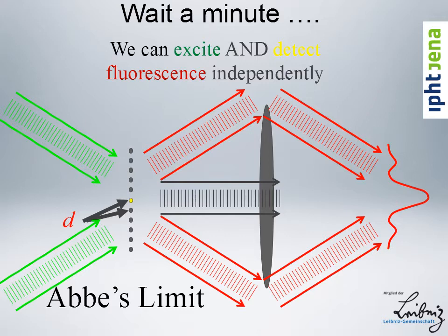This is very different in fluorescence, where the fluorophore does not react as linear scattering does, to amplitude, but it reacts to intensity. So it's the quantum mechanical process of absorbing a photon and independently emitting a randomly phased new photon. This is really the key to superresolution in the linear superresolution sense.